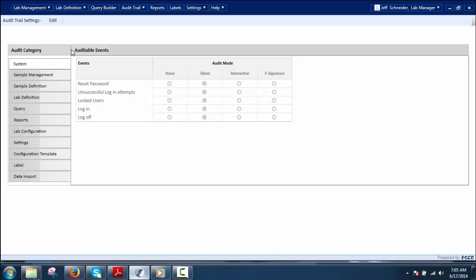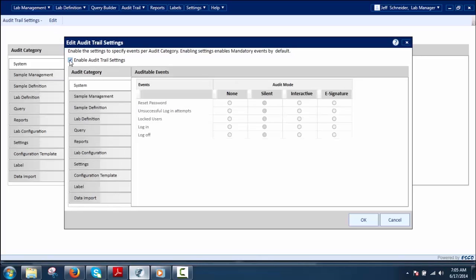To enforce the audit trail, the user can turn it on and off as required. Click Edit in the Audit Trail Settings to open the Edit Audit Trail Setting dialog. Click the checkbox to enable audit trail settings to turn on audit trail logging for defined activities. Once enabled, the audit log of system events will start by default in silent mode and the user cannot change the audit mode of these events. The user can set the audit modes for all defined events.